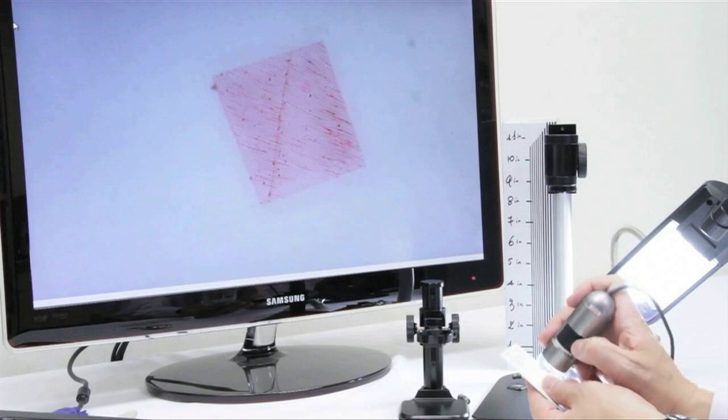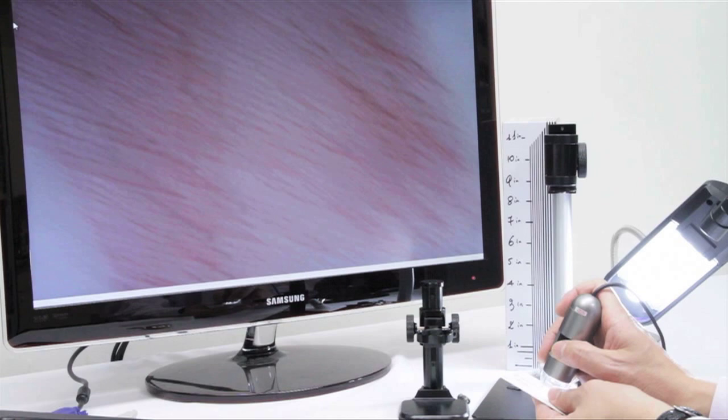This microscope is also great for viewing slide specimens. We can zoom in all the way to 200 times magnification.